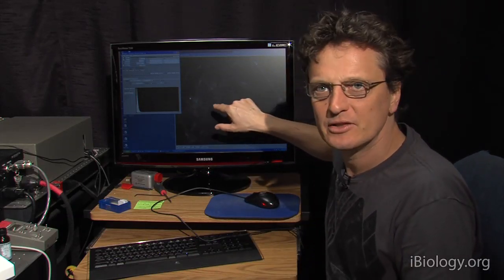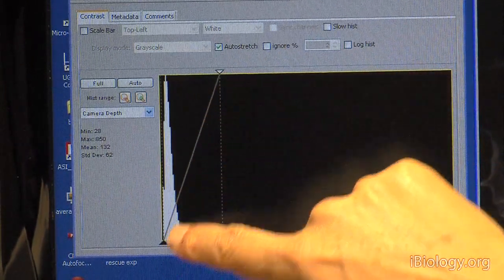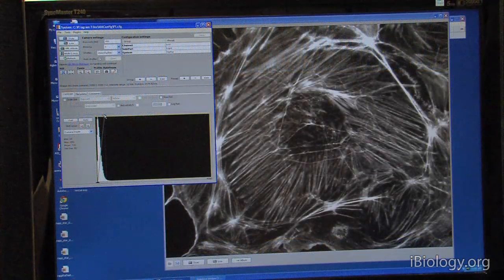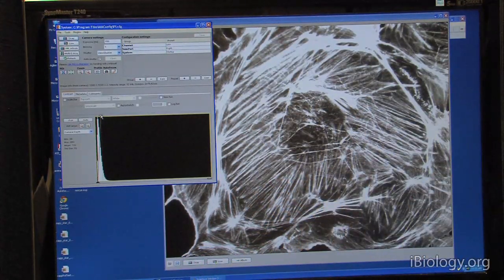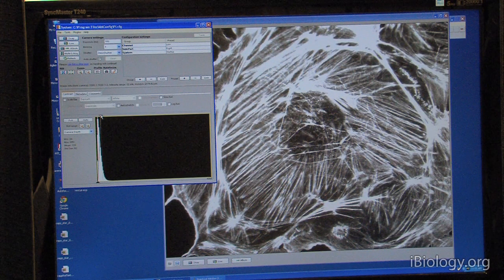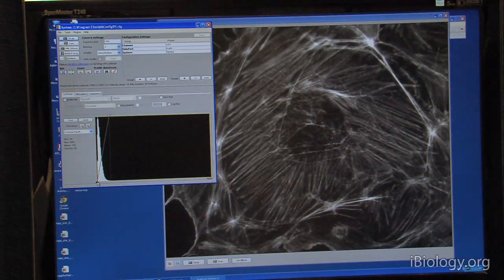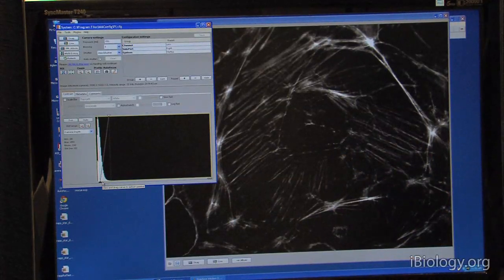So, to map the intensities that are available on the camera on the display, we need to have some kind of function. And that function is shown in this same graph. That is the line going from the dark triangle here to the bright triangle. Were I to move this line to the left, then my image here gets a lot brighter. Because we make pixel values that are lower and lower, whiter and wider. Were I to bring this left slider here, the dark slider to the right, then you see that we get more and more black in the image.